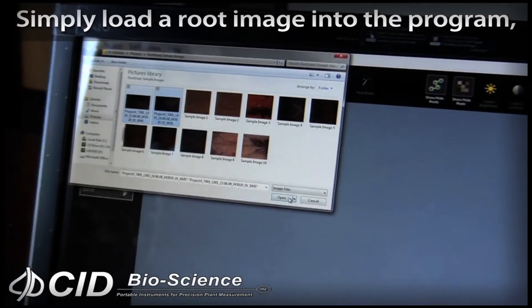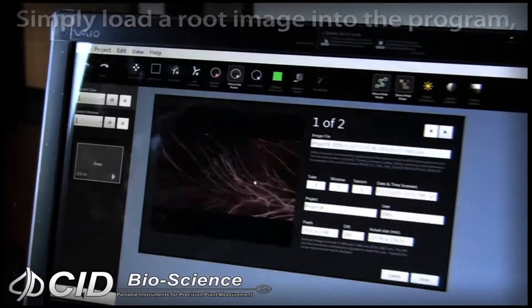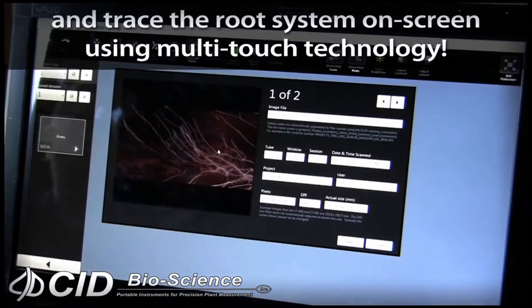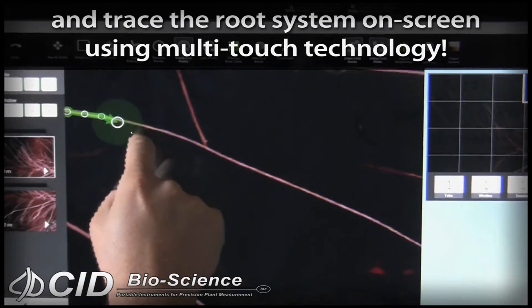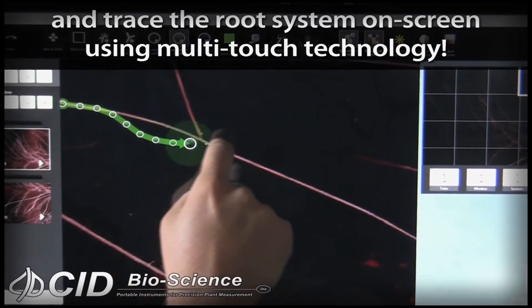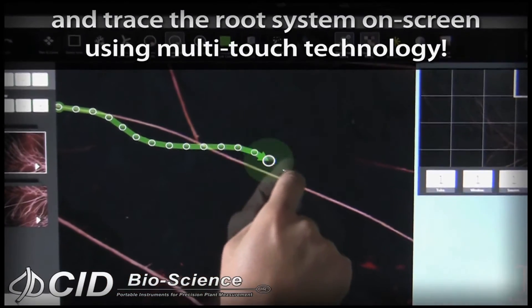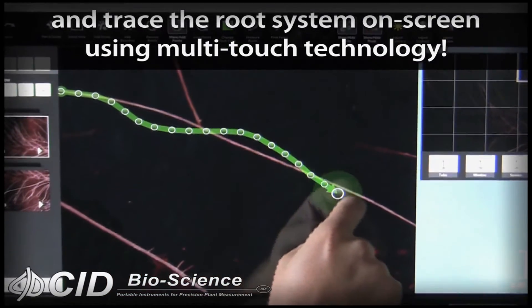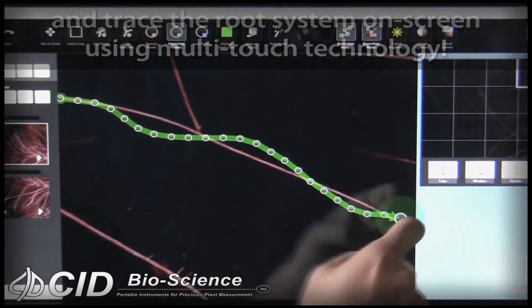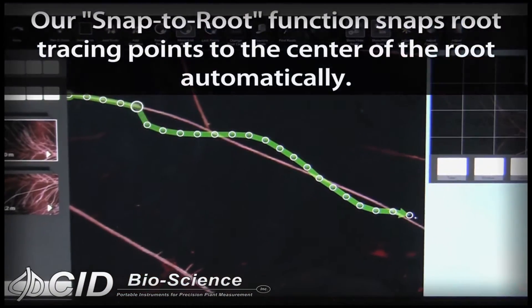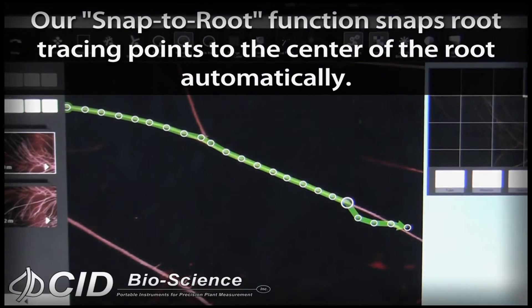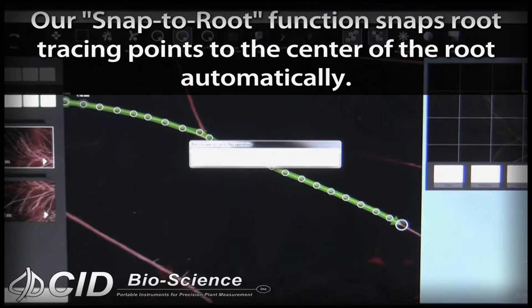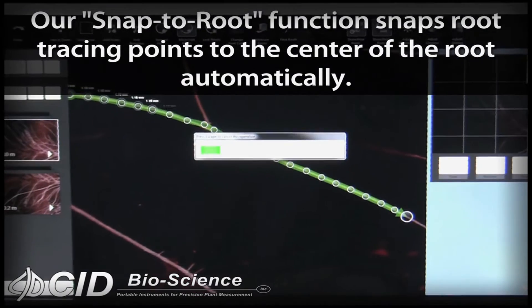Simply load your image into the program, then trace the root system on screen using the multi-touch interface. The Snap to Root function relocates root tracing points to the center of the root automatically.